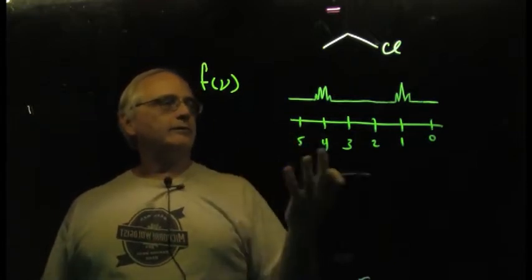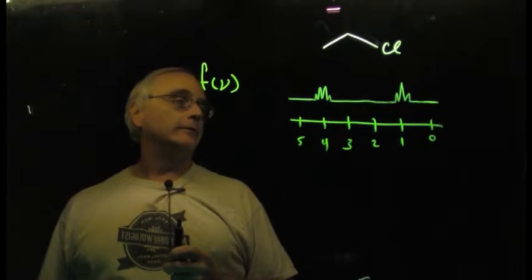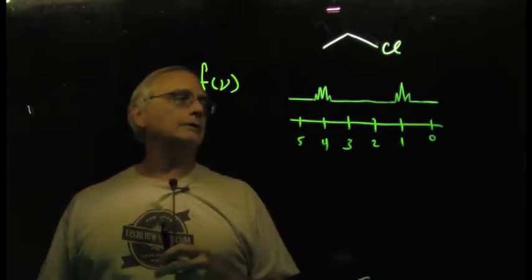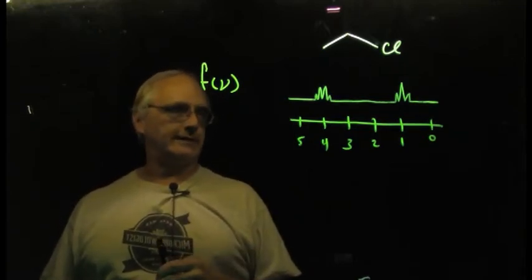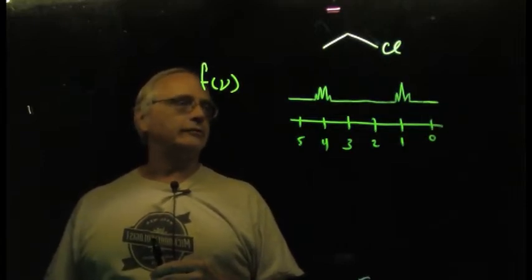And when I first obtain spectra, if I see this show up, let's say in the computer display, when I first run this molecule, I will look at it and say, oh, look, I have two resonances. There must be two groups of distinct protons in this thing. But now I want to count the number of protons within each group.